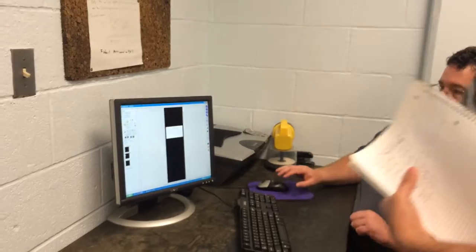So we'll go ahead and hit the light switch. We have different buttons you can push. As long as the camera works okay, yeah it looks okay. So anyway, we have our preview scan. And this gives you an overall scan of the entire microarray. The first thing that you'll see is red image. This is a red laser scanning the entire microarray. Again, this is in a preview mode. And so if you look at the image here, you can see kind of a shadow of where the actual spots were labeled. I'm going to change the contrast a little bit. And you can kind of see a shadow of where the spots are. Now this is a really low resolution on this preview scan, we're talking around 40 micrometers. Then we're going to do a scan that will allow us to do 5 micrometers where we're going to really analyze the individual spots. And so here's the image right now.